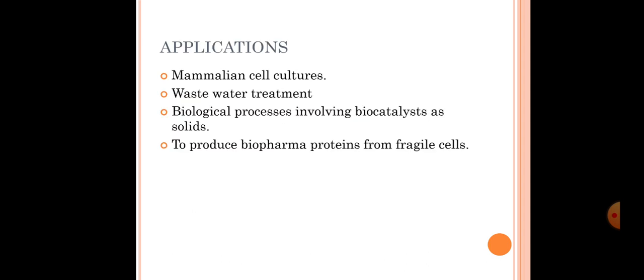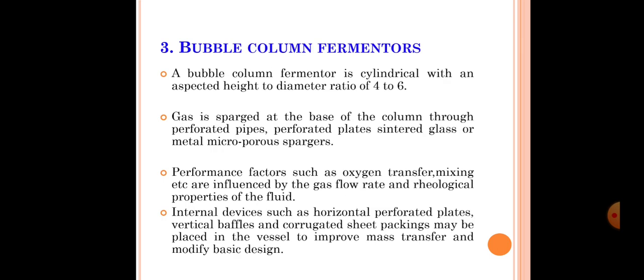Applications: it is used for production of mammalian cell cultures, wastewater treatment, and biological processes involving biocatalysts as solids to produce biopharm proteins from fragile cells. Next, moving on to the third type of fermenter, the bubble column fermenter.